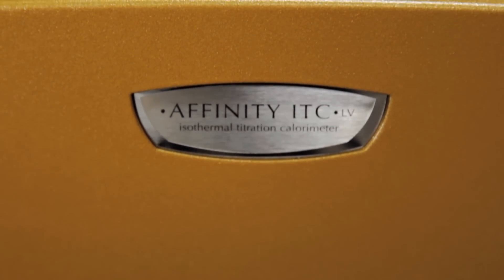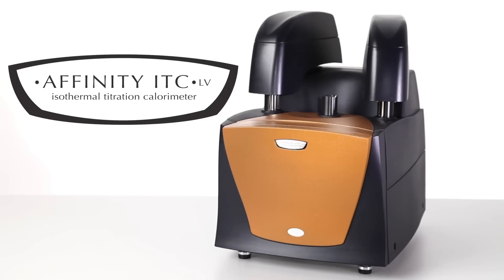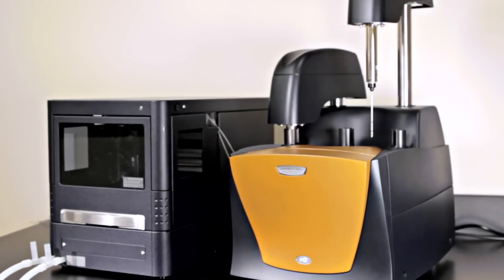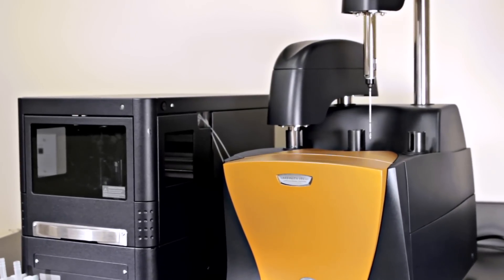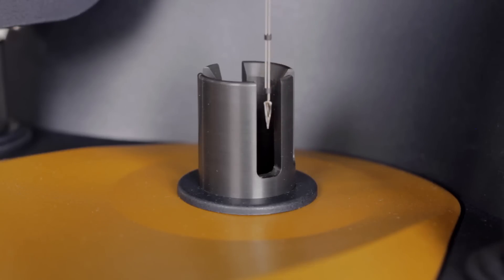What others have attempted, TA Instruments has perfected with the all-new Affinity ITC. This fully automated instrument offers unparalleled performance, ease of use, and reliability.